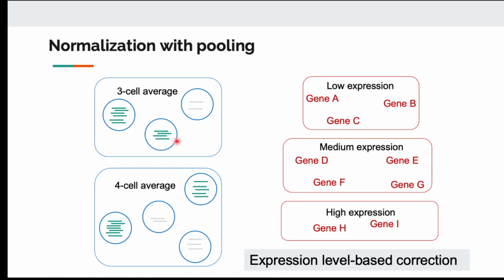Okay. So after we filter out dead cells and other droplets that we don't want to analyze, the next step would be how to deal with the missing data, how to deal with the noisy data, the expression level that we get, how can we stabilize them. So people proposed several ideas. Ten years ago, people proposed several ideas to handle this. Some people said, can we do an intermediate? In bulk transcriptomics, we clump all the cells together and we get one measurement. For single cell, we isolate all the cells and we get all separate measurements.